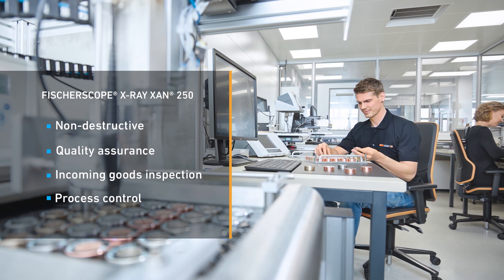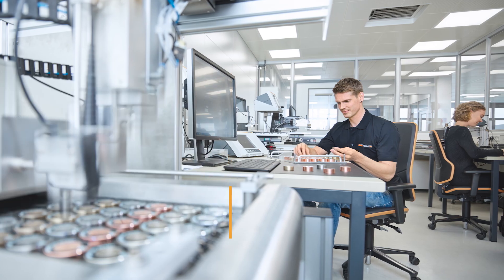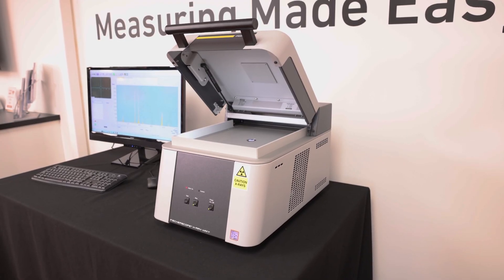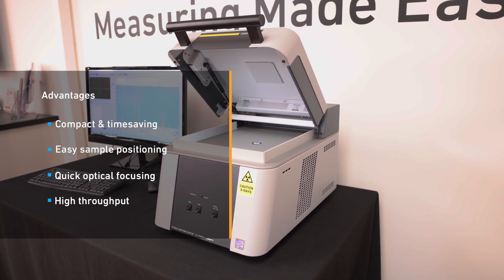The instrument is well-suited for measurements in quality assurance, incoming goods inspection, and process control. The X-Ray beam direction is upwards, which allows a compact design that's perfect for a wide range of sample shapes and sizes.